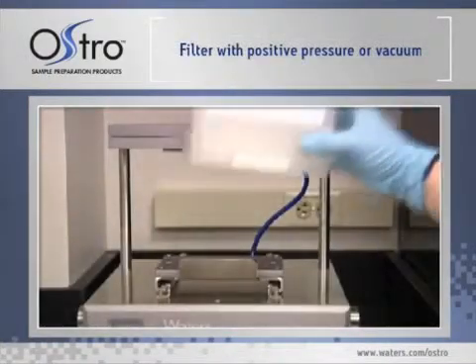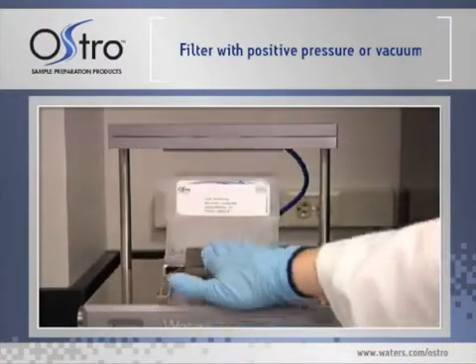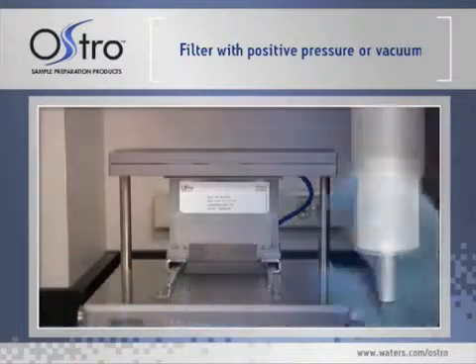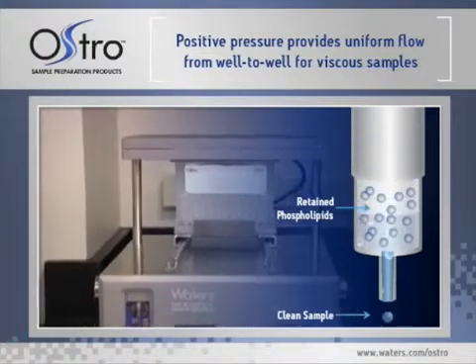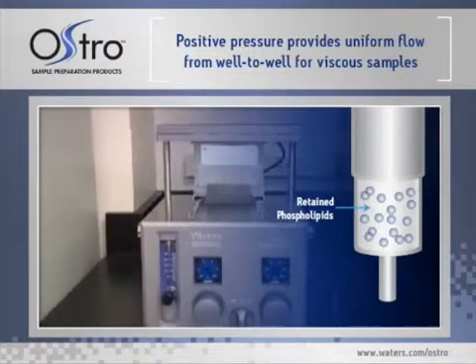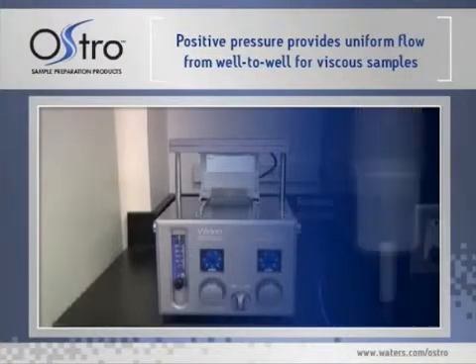Next, filter the sample into a collection plate using a positive pressure processor set to 60 PSI for 5 minutes, or use a vacuum manifold at 15 inches of mercury for 5 to 10 minutes. The benefit of using positive pressure is that it provides uniform flow from well to well and is especially effective for viscous samples. The Ostro proprietary plate design prevents liquid flow through the device until force is applied. The Ostro material retains phospholipids and allows the analytes to pass through.